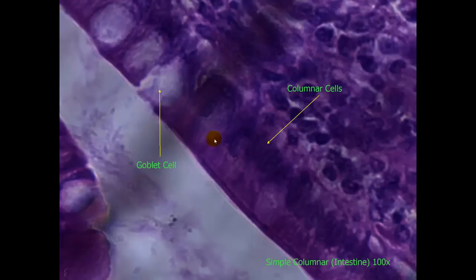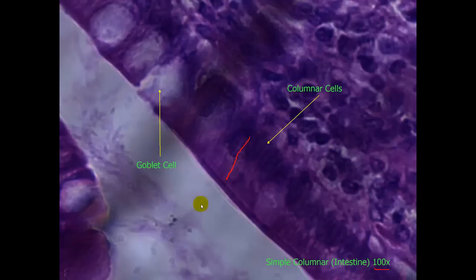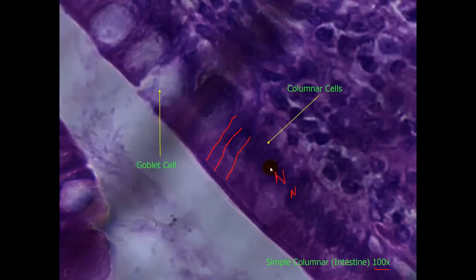Here is a 100x view of the same cells. Here is our goblet cell, indicated by the yellow arrow. Here are our columnar cells — we can see the cell membranes a little better by these clear areas. Each of these dark areas is in fact the nucleus of those cells.